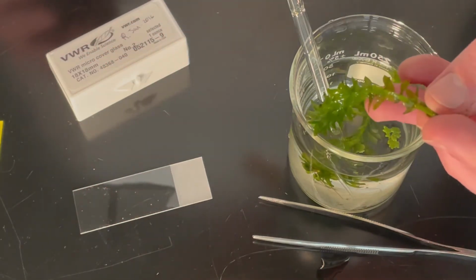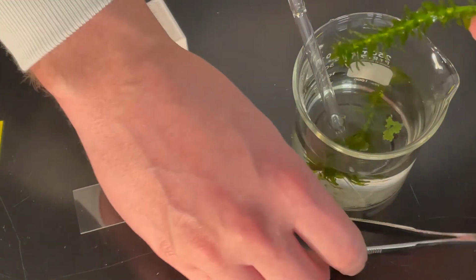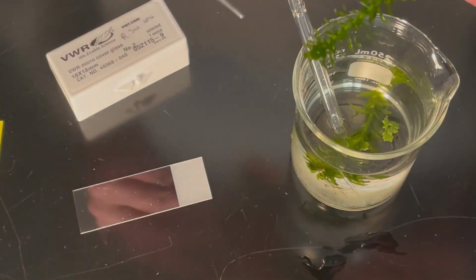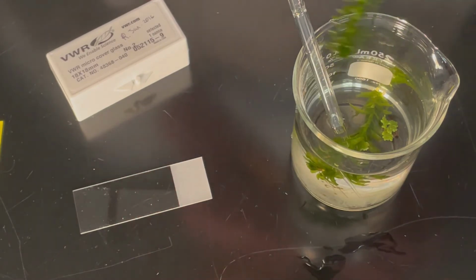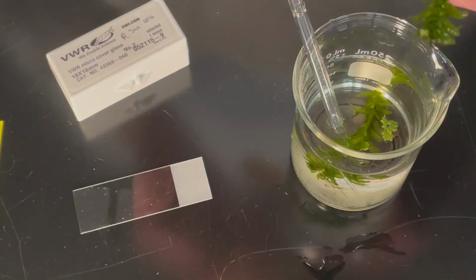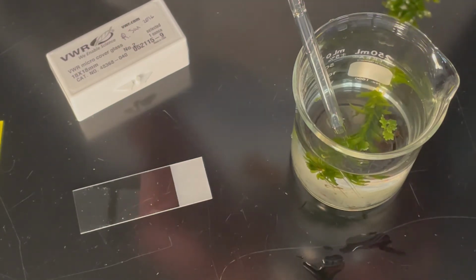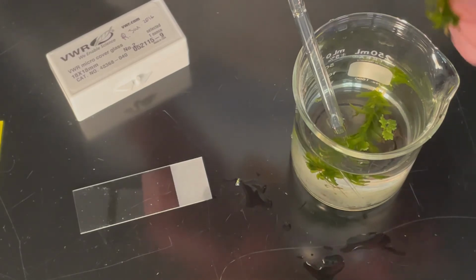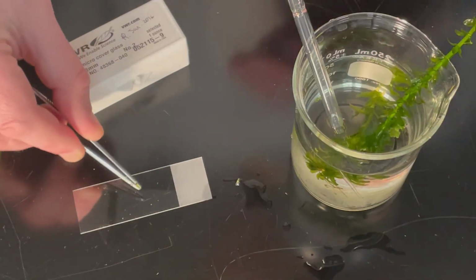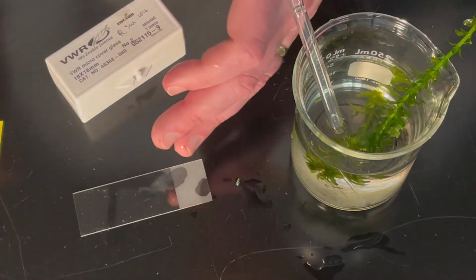This is the specimen that we're going to be using. It's an aquatic plant called Elodea. Now Elodea is really nice because the leaves are very, very skinny. They're actually only 1 or 2 layers of cells thick. So they're very nice to view on the microscope slide. What I'm going to do is try to find a nice looking leaf, something that's still green and is going to hopefully look nice under the microscope. So add that to my slide.